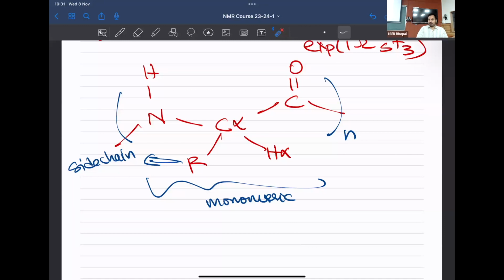This is the HSQC. Similarly, you can do an experiment between the H and C, where you repeat the HSQC type experiment to get the chemical shift of H alpha and C alpha. All that I've done so far is to repeat what we have done before to put into context how we are going to build bigger experiments.